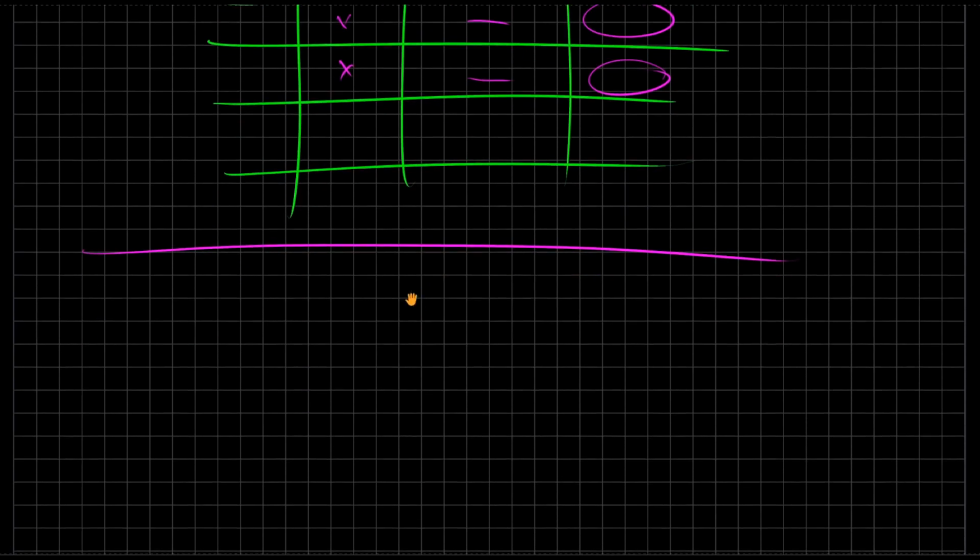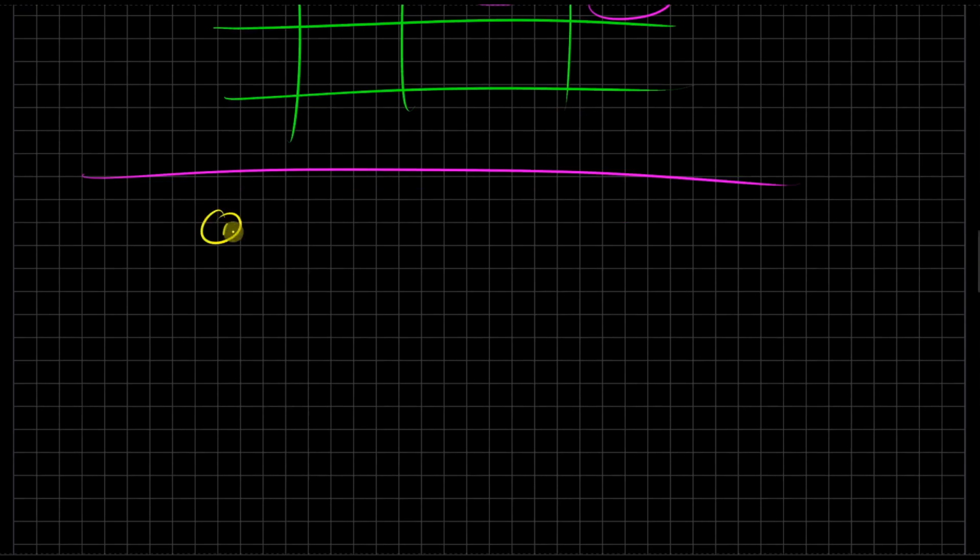All right, some of the things to remember as we finish up this lab is bleach can stain your clothes, so wear clothes that you don't mind getting stained, or rather bleached, right? So wear appropriate clothing.